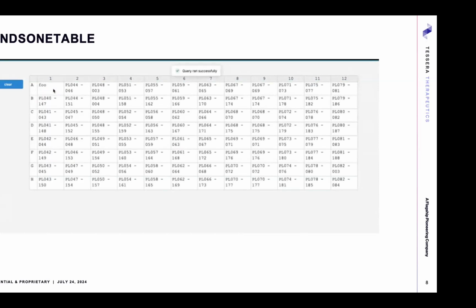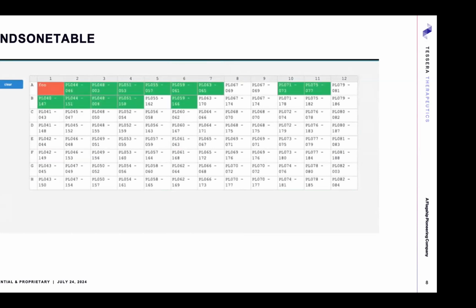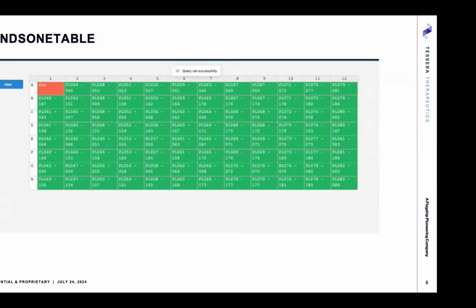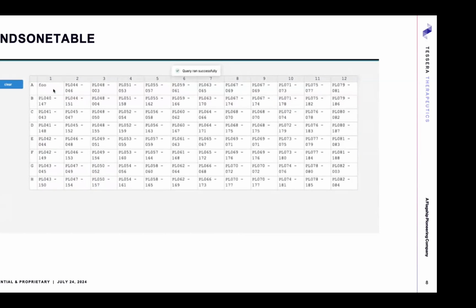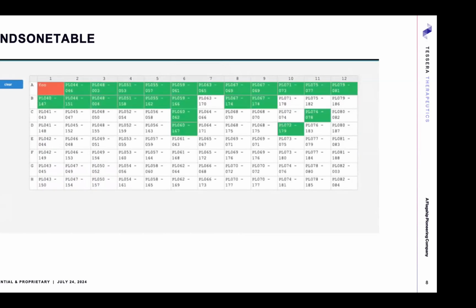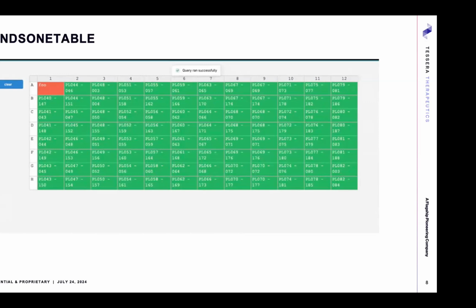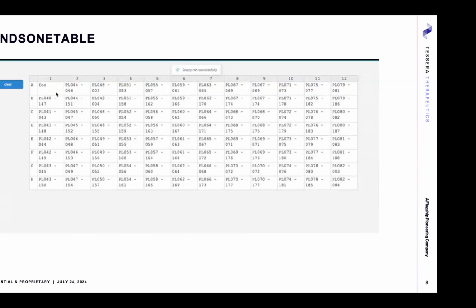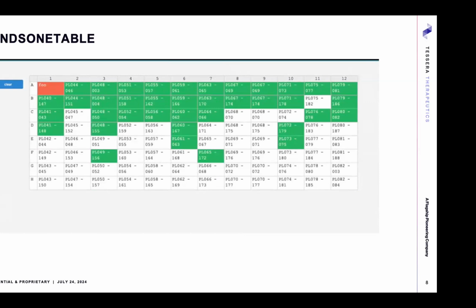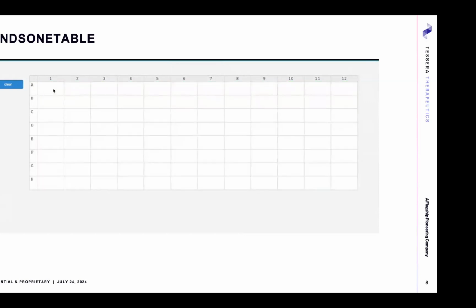So if you have a list of numbers for concentrations, you can highlight a region of the frame, right-click it and say this is nanograms, and it will decorate all the entities as a number and a unit. This is fully programmable, so it's all JavaScript. I can write it all in JavaScript. I can build all sorts of capabilities. We're using it for a lot of high throughput plate stuff.